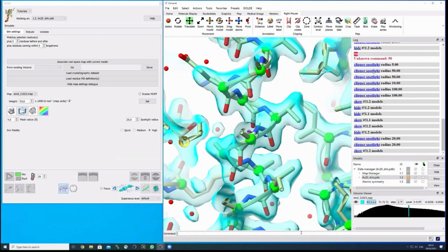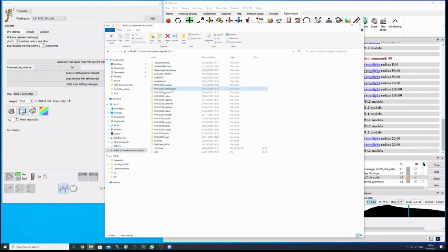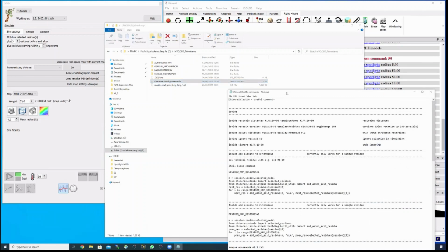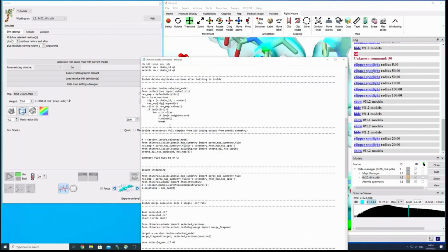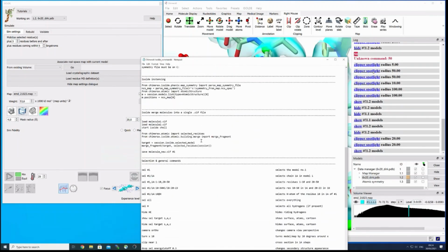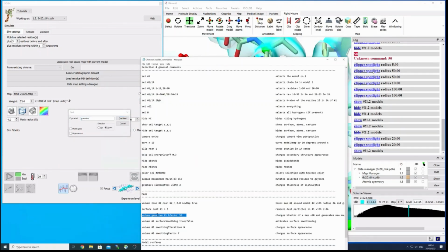And the way to do this is you say, I need to check myself. That's one of these commands I typically have in my mind, but now, of course, I cannot recall them. So I sent you this file where I also have all these commands listed. Here I have it.